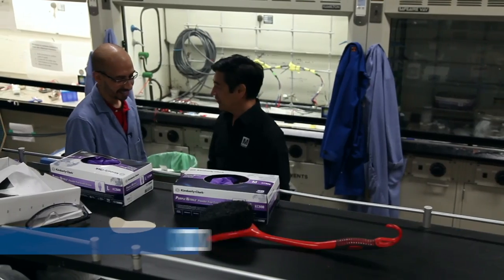Nice to meet you. So you're going to do a demo here of how you make graphene.